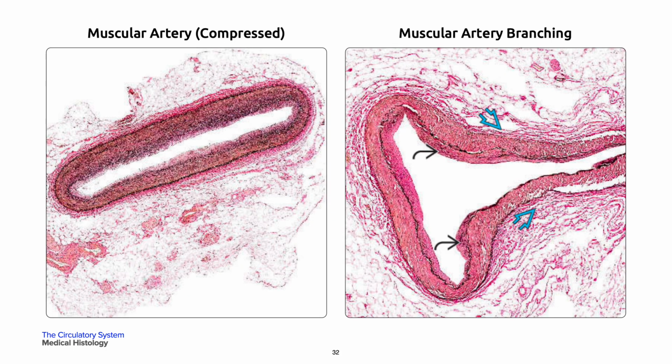On your left is the lumen of this artery, which is elongated and narrowed rather than the usual circular appearance, but this reflects an artifact of compression during tissue fixation. On your right is a perpendicular branch (bold blue arrow) which arises from a muscular artery. Note the difference in caliber between the main artery cross-section and branch longitudinal section, and note also that the tissue layers and elastic lamina are continuous from the main artery to the branch, with thickened intima at the junction (curved black arrow).